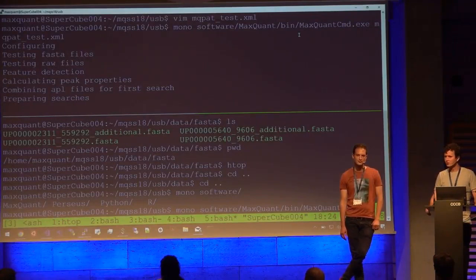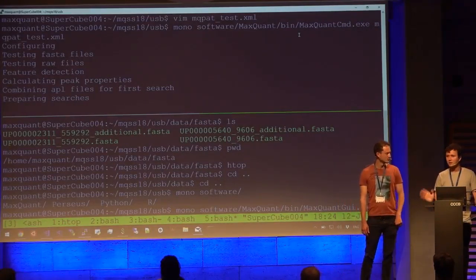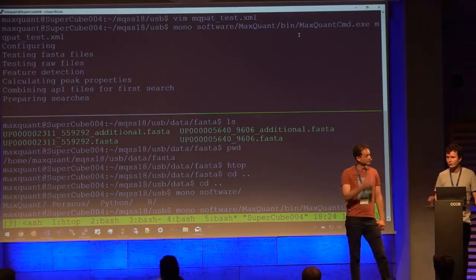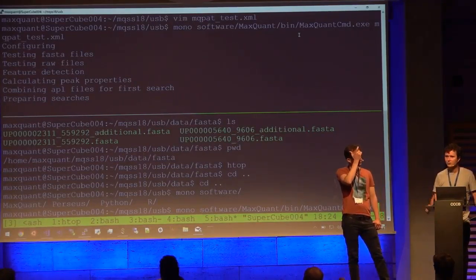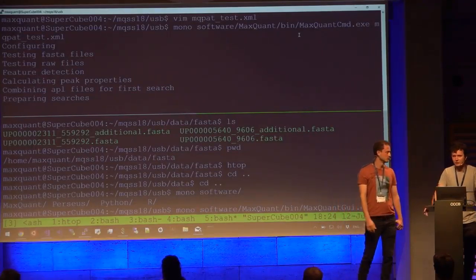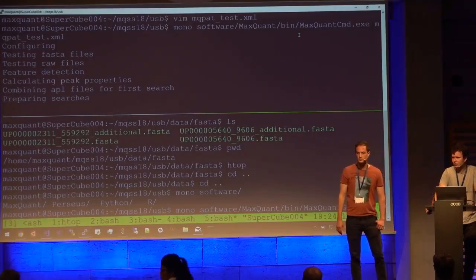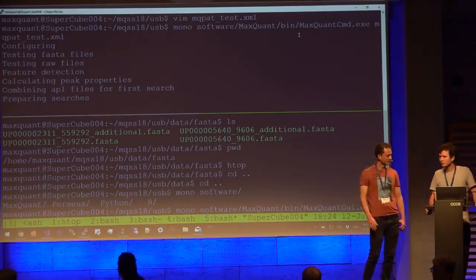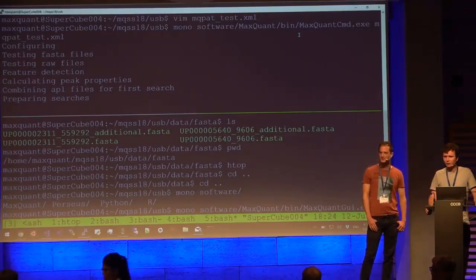Okay, that's probably crashing. Let's do it like this, I will come to check. Yeah, it's an important thing that the command line works perfectly smooth, nice now. There are some problems sometimes, but it's not critical. But the graphical interface is under testing, let's say. Okay. But it should work actually. I'm surprised. Should check. Yeah, maybe we can fix it just after the session. Okay, one more question.